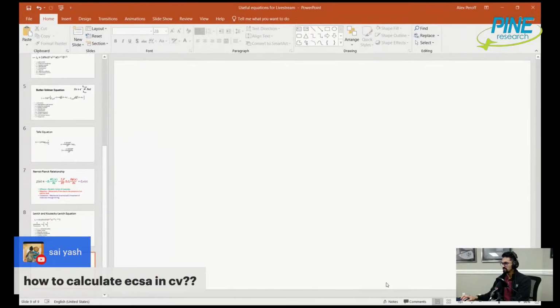actually share our screen, and let's go here, and I'm just going to check because I am riding solo today. It is just me doing this, so let's see. Okay, all right, so I want to know how to calculate the electrochemically active surface area using cyclic voltammetry.